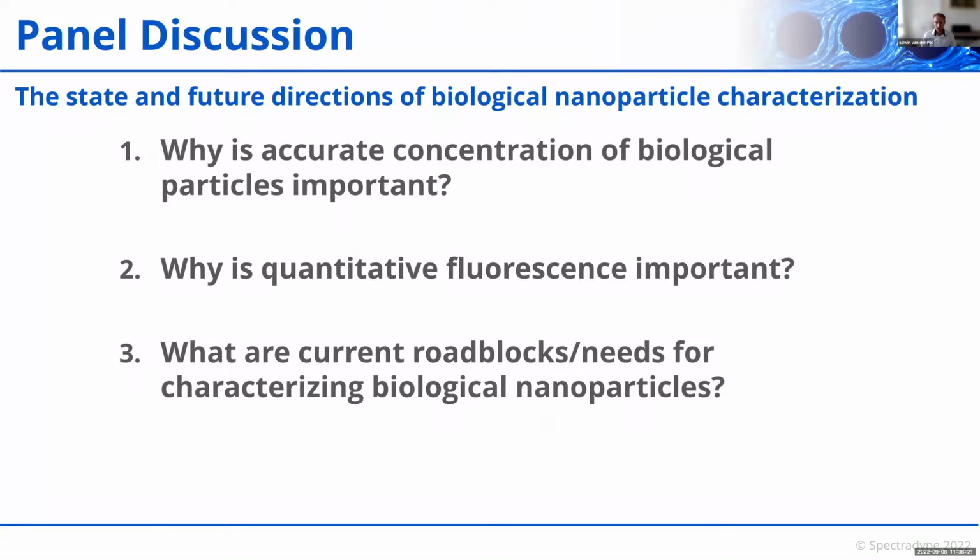Either people isolate particles and they apply omics kinds of methods or other ensemble methods, or they do single particle detection. Now, in single particle detection, you have several options since about a decade, like flow cytometry, like MRPS, like NTA, and a few of these technologies become more and more sensitive, and they are now below 100 nanometers with their sensitivity.